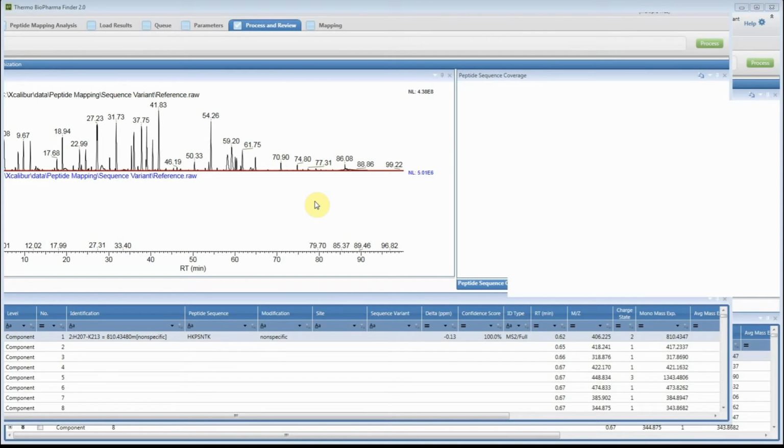Hi, and welcome to the BioPharma Finder 2.0 help video. In this video, I'm going to demonstrate some of the new features for the peptide mapping workflow.